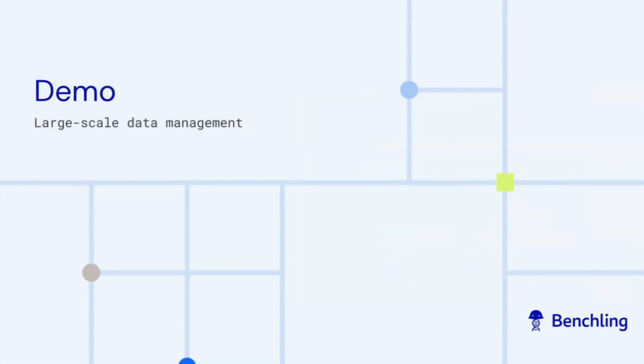So as Caitlin mentioned, I'm going to showcase these features in action. You will look at the faster data access, improved storage and permissions, and how they enhance your Benchling experience. The best part of everything is that if you have Benchling, you have access to these features. You're already enjoying them right now. So to do this, I'll be playing two roles. The first role, I'll play a scientist. I should put on my old lab coat here.